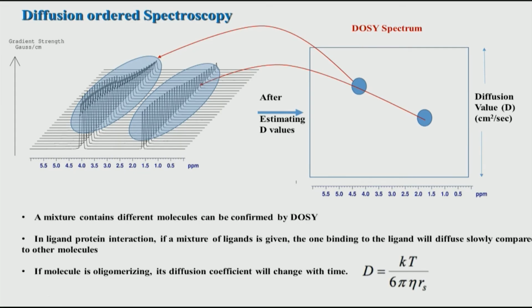So, this is how Dosy is applied. Dosy helps you to figure out that the sample you have may contain a mixture of different molecules, and this can be confirmed by Dosy.